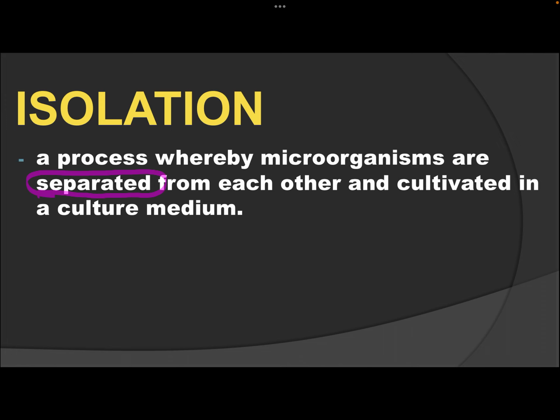Remember, if you are a nurse or you have worked in the hospital before, normally the patient would just submit a specimen to the laboratory, right? And that specimen, let's say a sputum or urine sample, might contain thousands or even millions of bacterial microorganisms. Because of the number of bacteria or other microorganisms present in that specimen, we need to separate, most especially, the pathogen from the normal flora which might be contained in the specimen. So that's why we need to isolate.